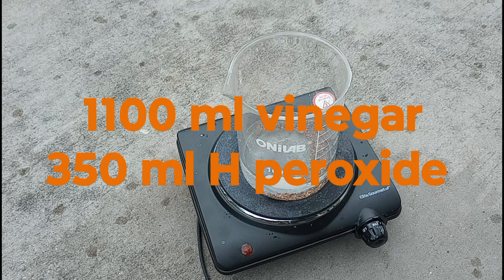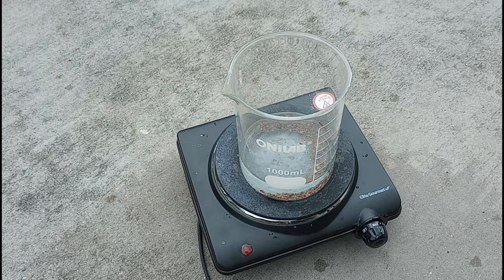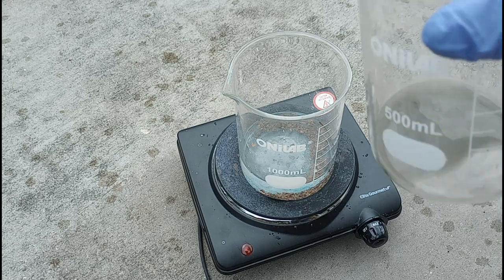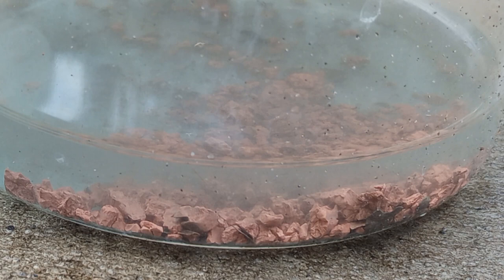So far we've added eleven hundred milliliters of vinegar and three hundred fifty milliliters of hydrogen peroxide, including what we did yesterday. We still have our liquid solution that we separated and the sediment that we separated out also. I don't know if you could tell, but it was raining when I started and the rain got heavier, so I had to quit and I didn't do a very good job of filming because of the rain.